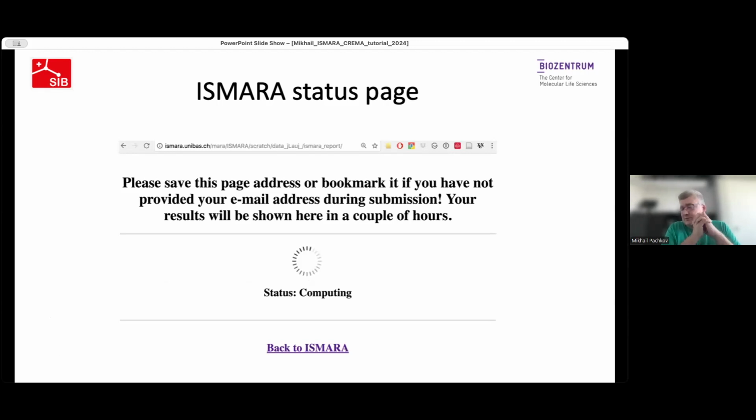So once data is uploaded to the server, either through the web interface or through the uploader script, the first thing which appears is the ISMARA status page of your project. A very important thing here is that people who do not provide an email address when they submit a job should save this URL somewhere in order to check their data later on.